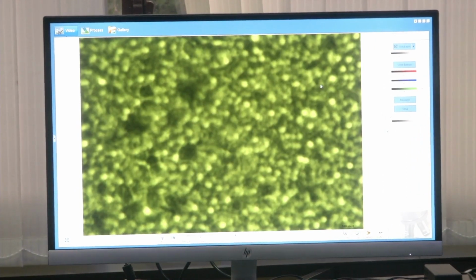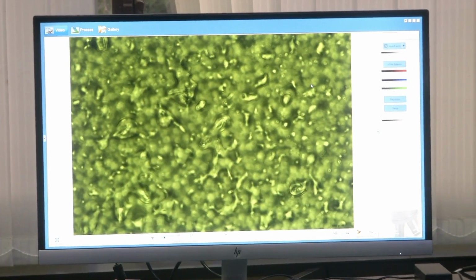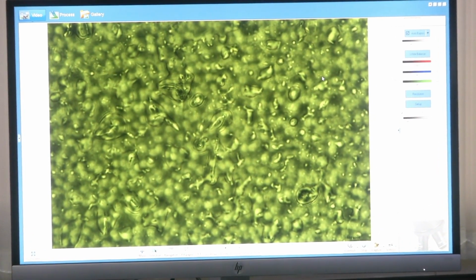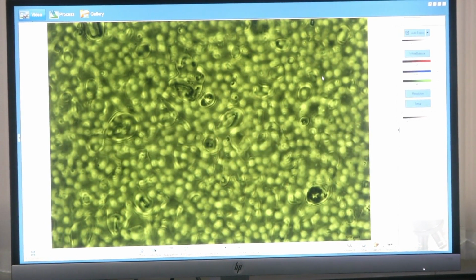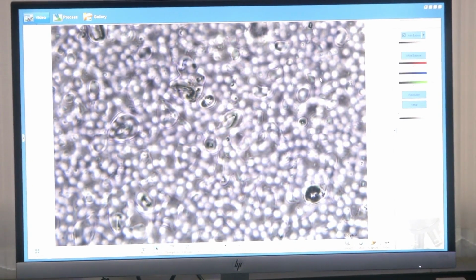Microscopy in itself is a very broad field, we are just giving you a glimpse of it, which is only required for you to characterize your sensors and your devices, like MEMS devices. So, this is the basics about the metallurgical microscope. Now, we will be covering the inverted microscope also, so you get a wholesome understanding about the different types of microscopes that are available. Thank you.